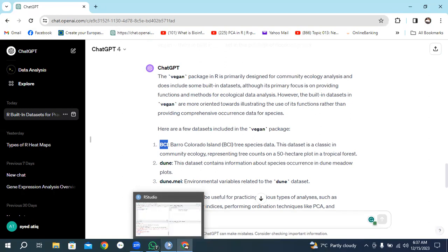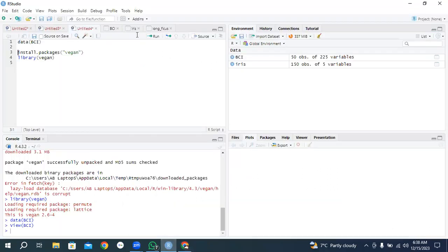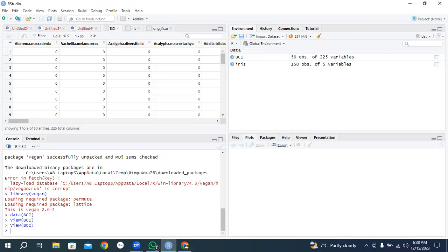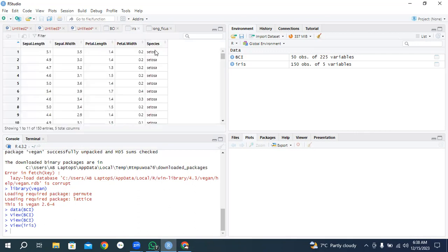It's just a format. It indicates that you can change it like this. Here you can see 1, 2, 3 for locations. You can change the location to Bangladesh, China, Pakistan, Japan. Anyone you can replace here. You can change its name, its abbreviations, anything. Similarly, as in the ficus case, you can change the species name. Anywhere you can change S1, S2, S3, you may use species names. So there is no issue to change here.